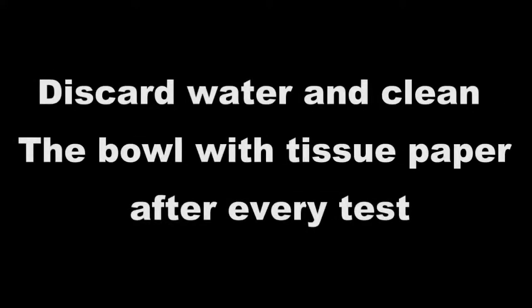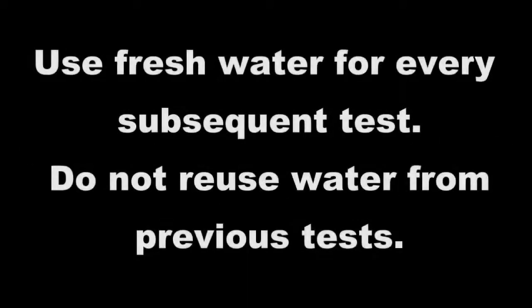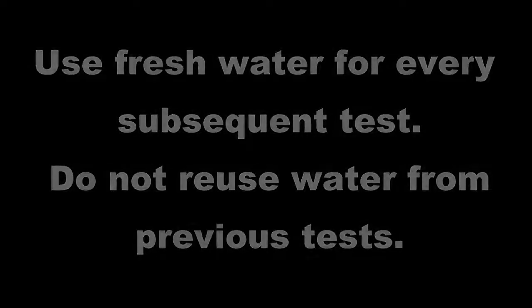Tilt the bowl and allow the water to pour into the dish below. Discard water and clean the bowl with tissue paper after every test. Use fresh water for every subsequent test. Do not re-use water from previous tests.